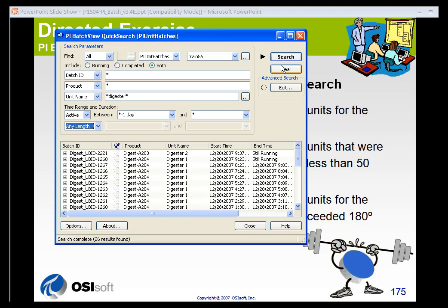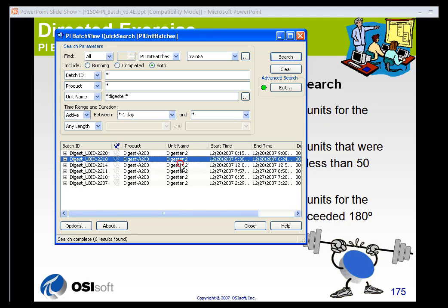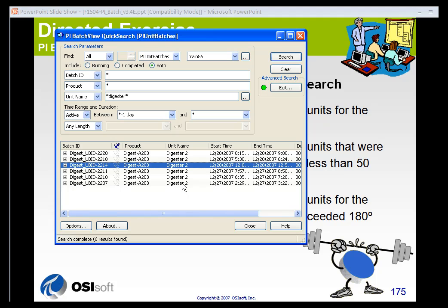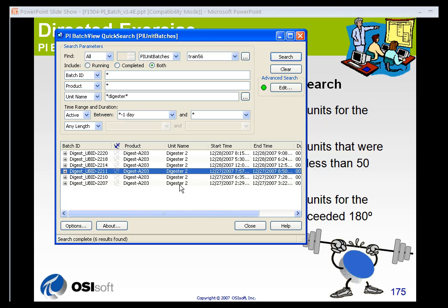Let's configure a different type of filter. I want to find out if one of my aliases — my temperature alias — was greater than a certain value for more than 20% of the time, to find out maybe if I overcooked something. I'll click Edit, and the advanced search dialog box opens. I'm going to add a filter: single-quote 'temperature', the alias name in single quotes, with the condition greater than 180. I want to know if that occurred in any of these batches for greater than 20% of the duration of the particular unit batch. I'll click Search, and I can see I have six results — they were all in digester 2. I can go and investigate those batches and see what happened, because clearly the temperature was higher for longer in these batches than in the other batches.